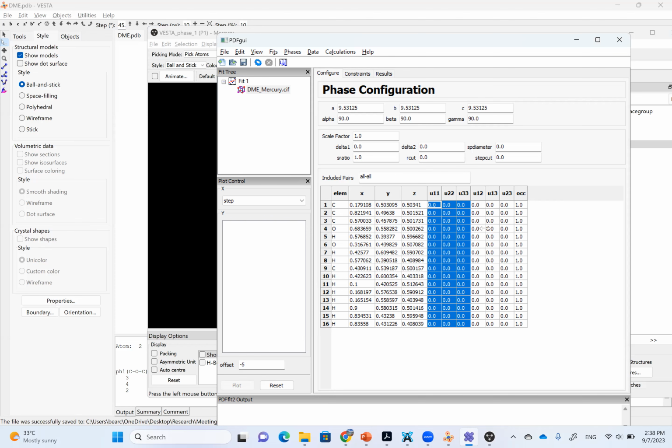That's a very reasonable B value for almost all the atoms. And in general, if the atom is heavy, the number is supposed to be low, right? And if the atom is light, then the number tends to be high, right? But here it's not a B value, it is the UISO. And that value relates to the B value by the equation UISO equals B value divided by 8 pi squared. Okay, those are all mathematics, which basically rationalize the physics.